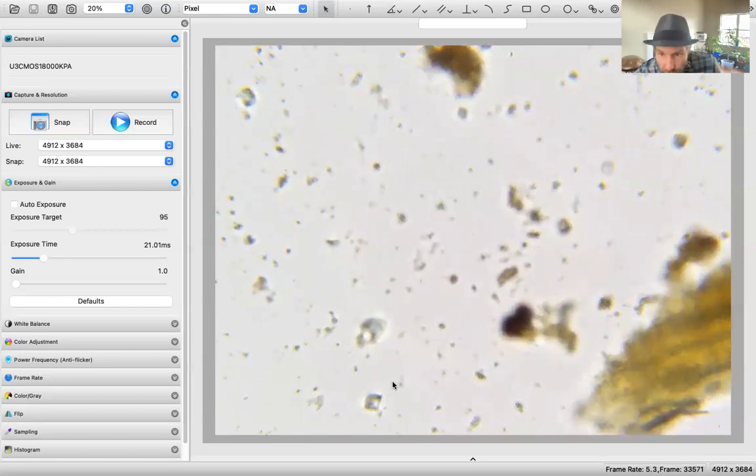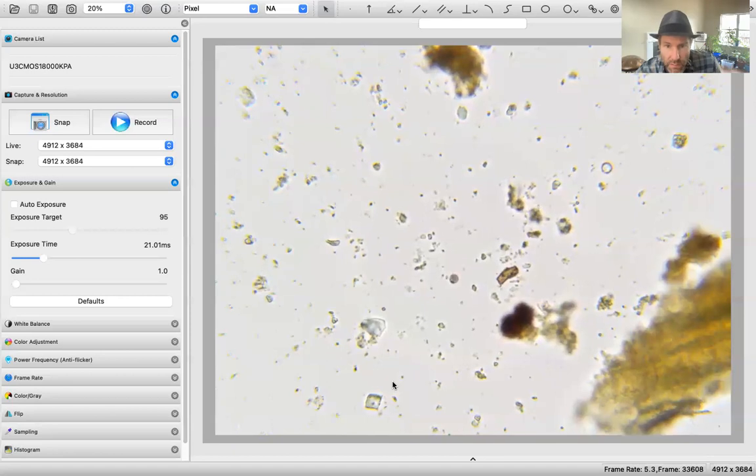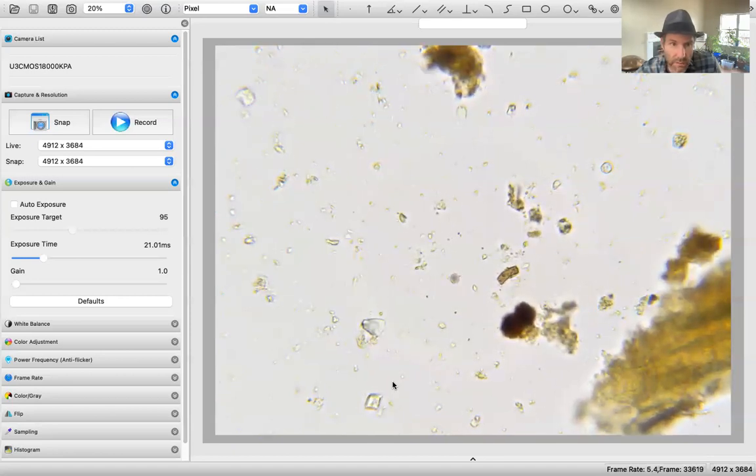It almost looks like there's a fungi bottom left. I can't really make it out, so we can't count it. Can't measure it, you can't count it. That's the rule. Okay.